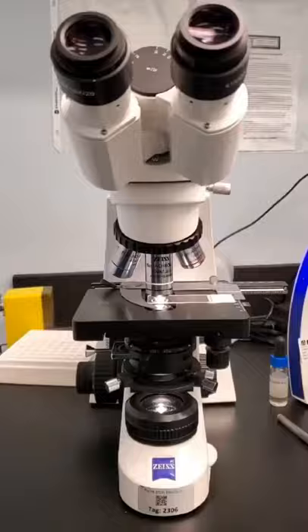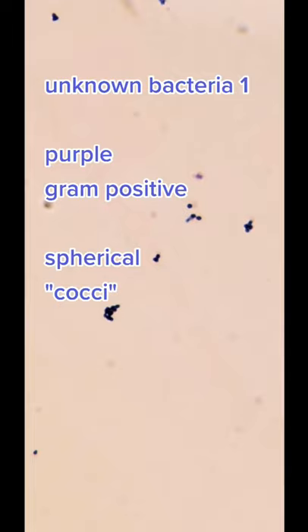Gram stain generally divides bacteria into two groups, gram-positive and negative, but also allows us to see their morphology or shape. My first cough isolate is purple, so it's gram-positive and it looks spherical. My next isolate was also gram-positive, but this one was rod-shaped. Lastly, my E. coli sample is gram-negative and it looks red-pink. Comment and let me know what you think I found in my cough.